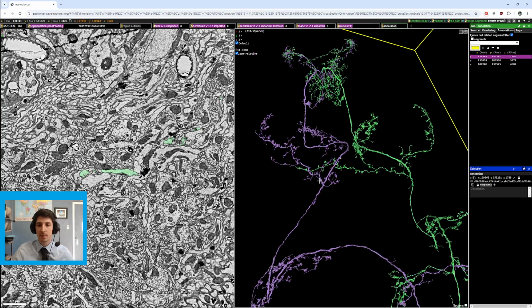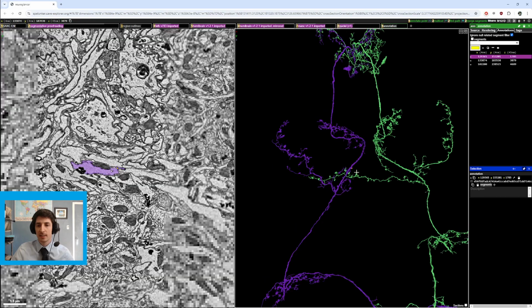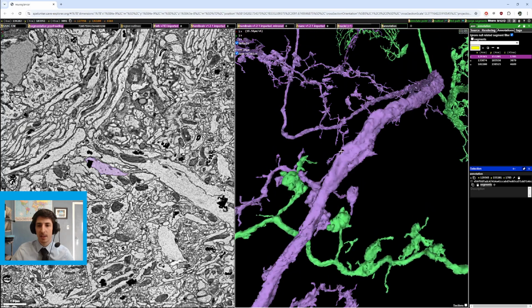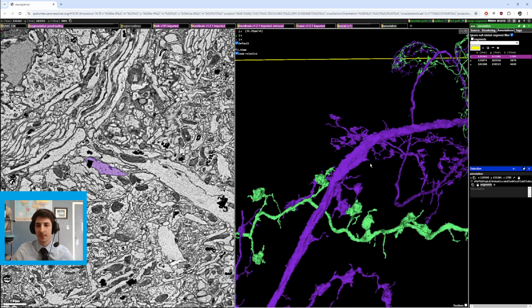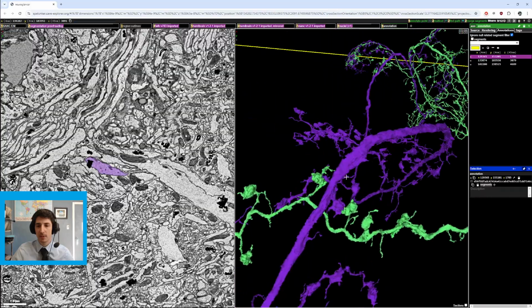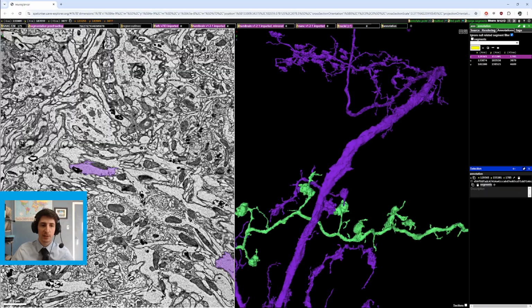It looks like it has the branch down there, so this branch is probably that branch. Let's just see what is over here. And as I zoom in on this area, this little break stands out to me, and this almost pointed shape is what I'm going to be looking at first.